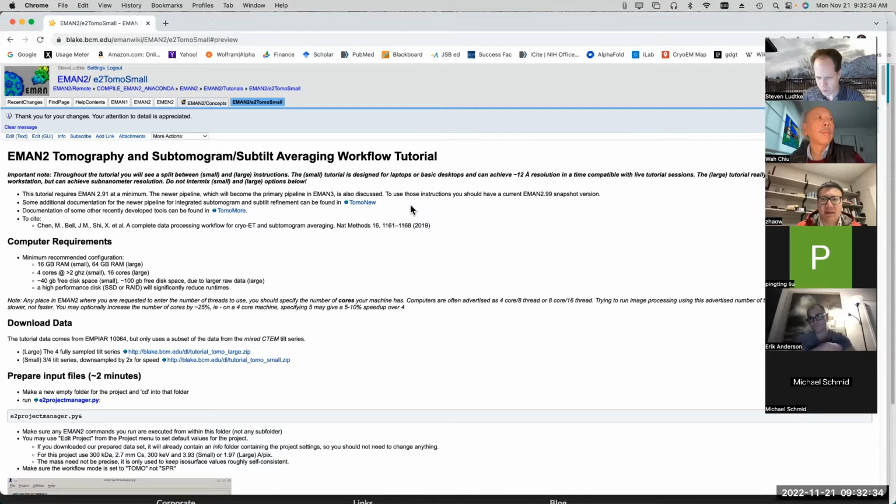So we did the 3 weeks on single particle analysis already. And the goal today was to move on to this subtomogram averaging tutorial. Then I expect we'll probably spend today and maybe next session on the subtomogram averaging tutorial, and then the week after that we'll move on to the Gaussian mixture model dynamics and flexibility stuff, and hopefully we'll manage to finish that stuff up before Christmas and wrap things up.